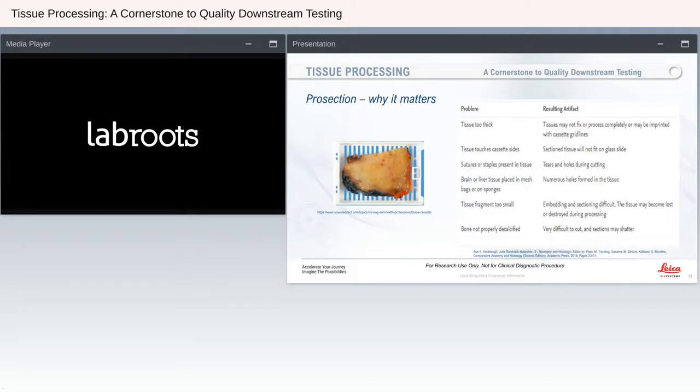Why does it matter when we're cutting our samples to be processed in those tissue cassettes? As you can see here from this section in the cassette, automatically you can see that it fits very tightly at the top and the bottom, not allowing maybe for the fluids to be able to agitate through. If this tissue is too thick, you're going to see that the interior of the specimen as you cut into it on paraffin is not going to section as well, or maybe under processed.